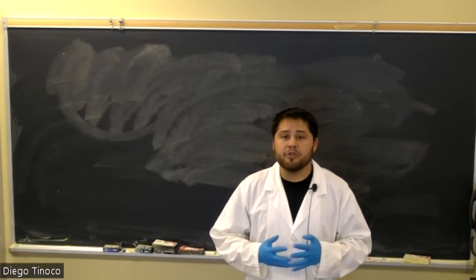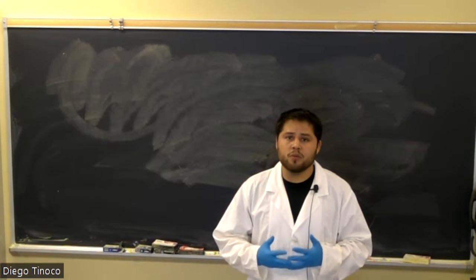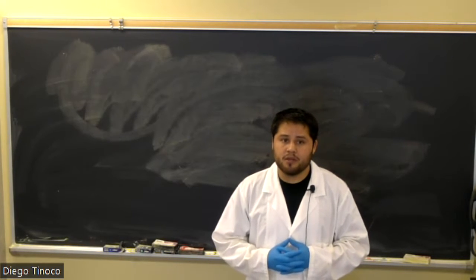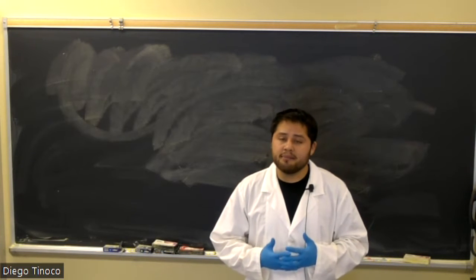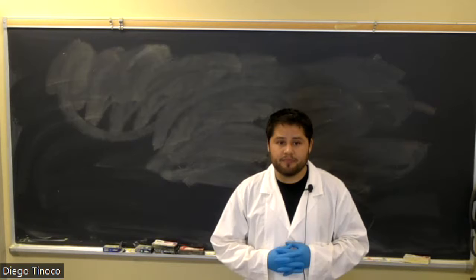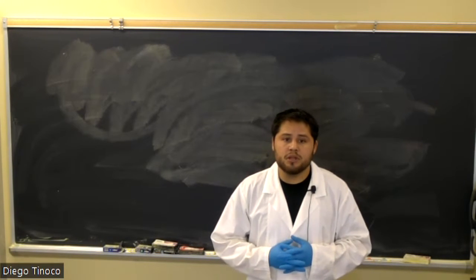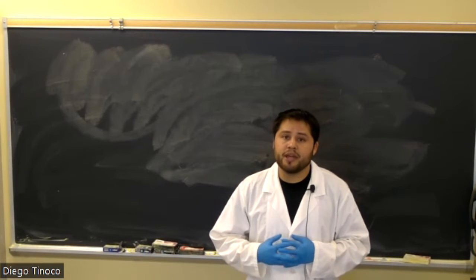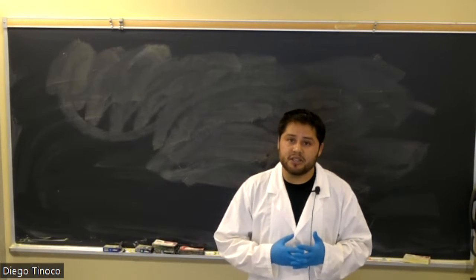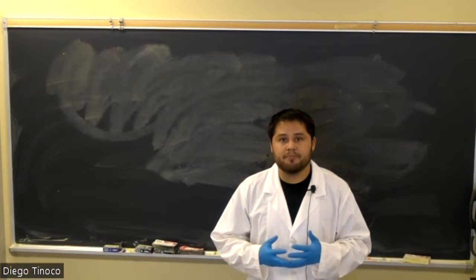You might remember making slime as a kid. And right about now, you might be wondering, why slime? As a college student, why would you be making slime? Well, now we will dig deeper into what happens chemically when making slime. In this four-part lab experiment, starting with part one, we will see how properties of our polymer strands change when reacting with our cross-linking agent, borax, creating what we want, slime.